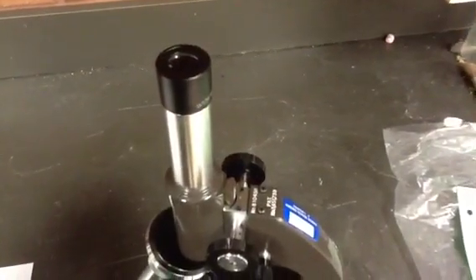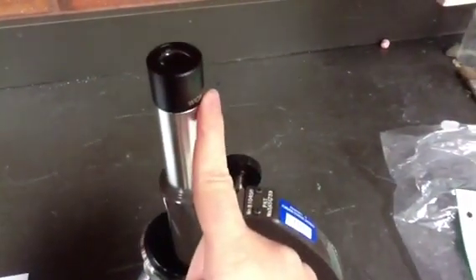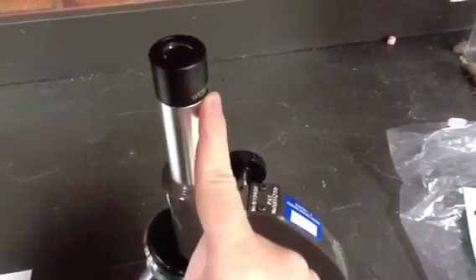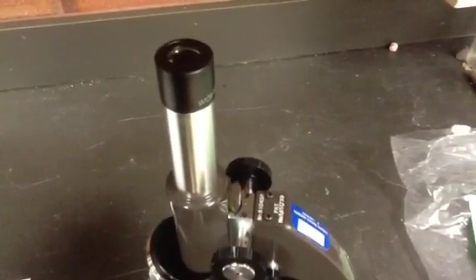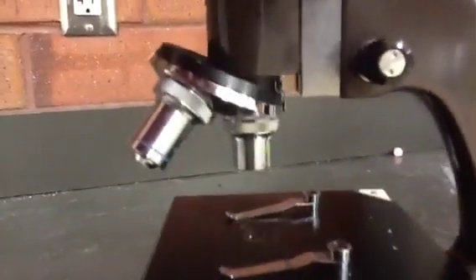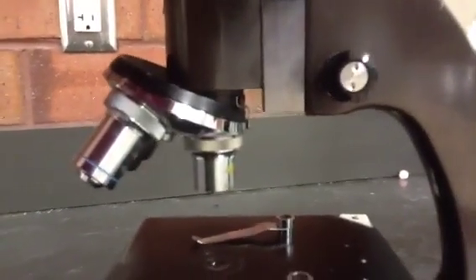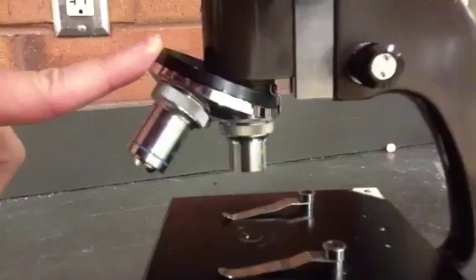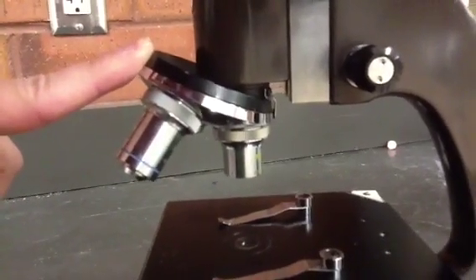This piece is called the eyepiece. It contains the ocular lens. The ocular lens by itself has a power of 10 times. So whatever you're looking at through the eyepiece alone is magnified 10 times its original size. The next part is called the nose piece. This piece contains the high and low power objective lenses. This is used to change the magnification of the microscope.